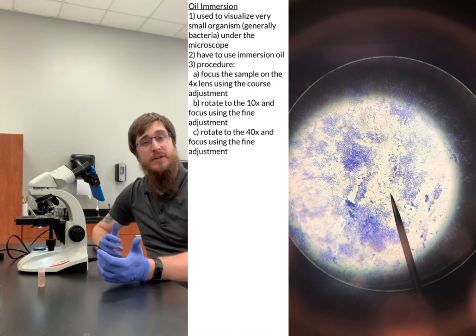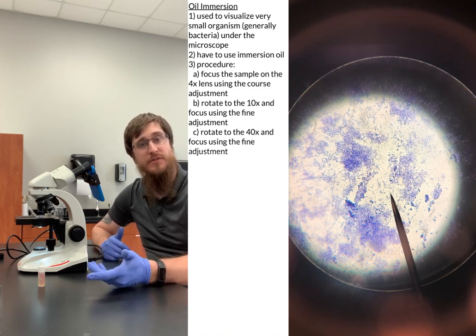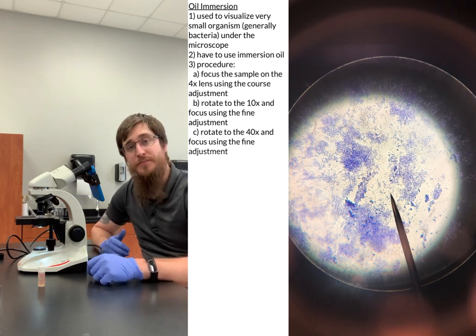And at this point here again, all we've done is just the same as what we've done in the other laboratory or in the other microscope labs. We've gone all the way down to the 40x and we focused it using the fine adjustment knob. So now we can actually do the oil immersion part.